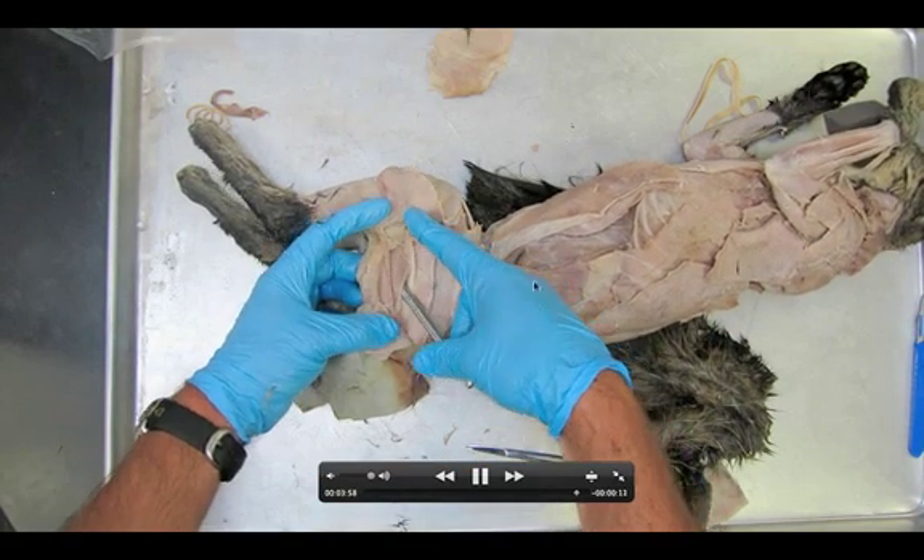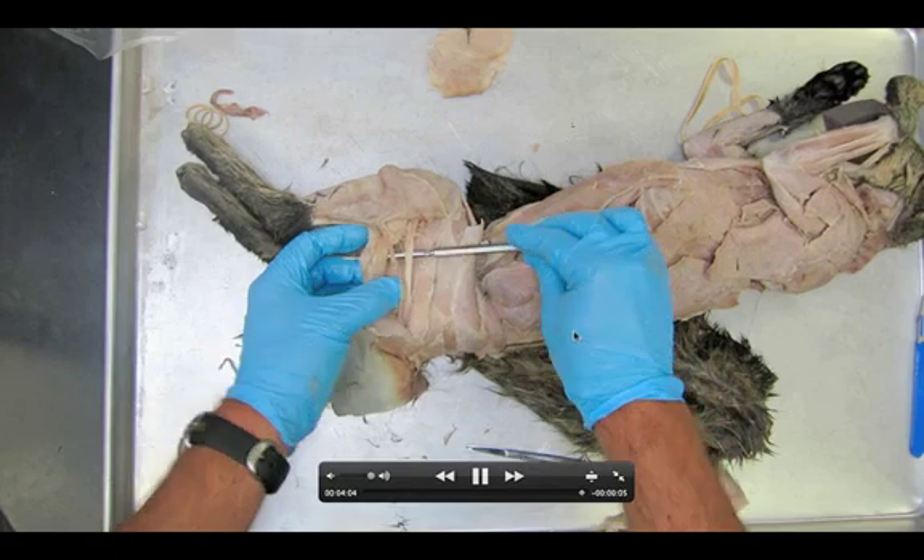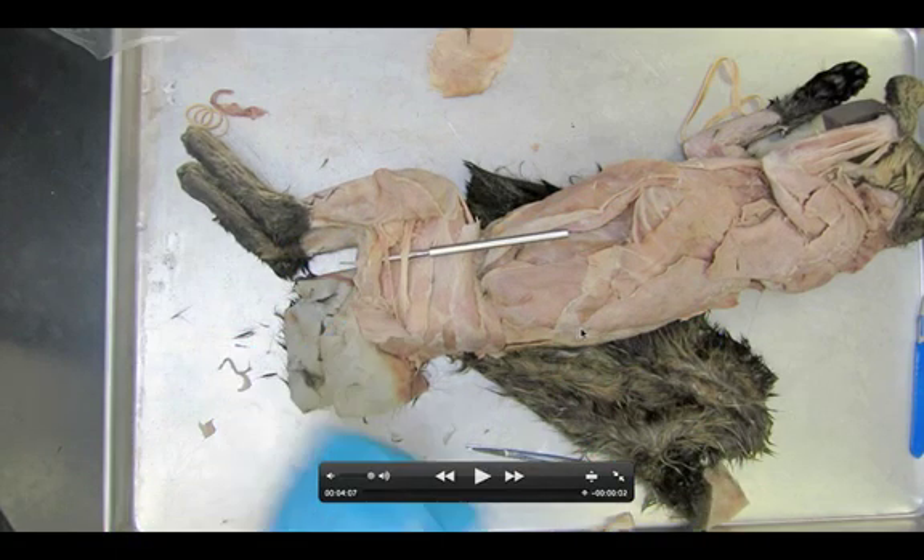The new structures are: tenuissimus, semitendinosus, and sciatic nerve. That is pretty much it — one of the simplest dissections. Let's highlight them: the only new structures we need to know are the sciatic nerve, the tenuissimus, and the semitendinosus. Super quick, super simple. Be careful about that tenuissimus — do not cut the biceps femoris until you have located them. All right, that's all. We'll see you guys in class.